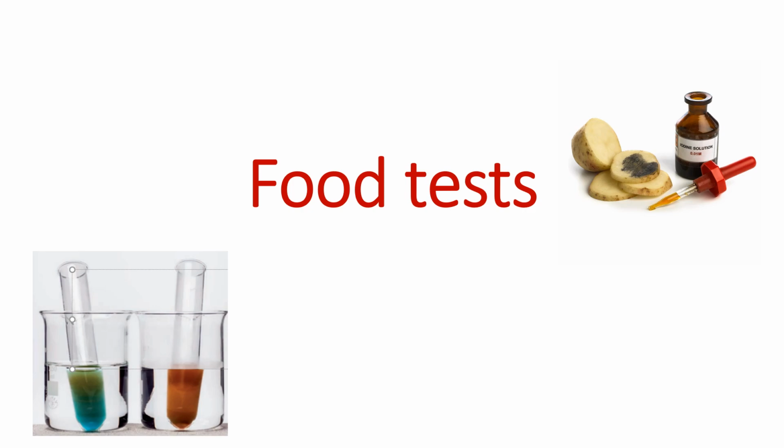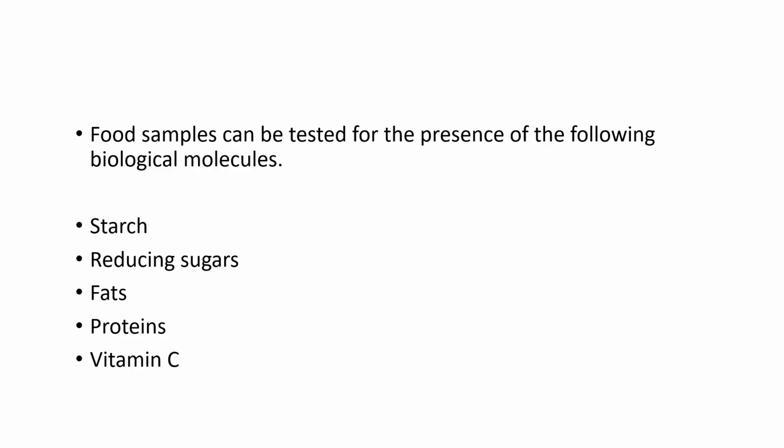This video is about the food tests that you should know for your IGCSE Biology exam. Food samples can be tested for the presence of the following biological molecules: starch, reducing sugars, fats, proteins, and vitamin C.